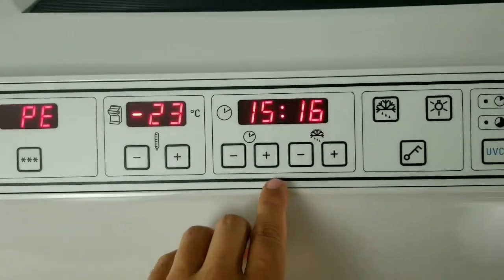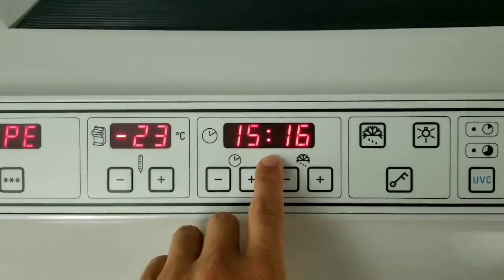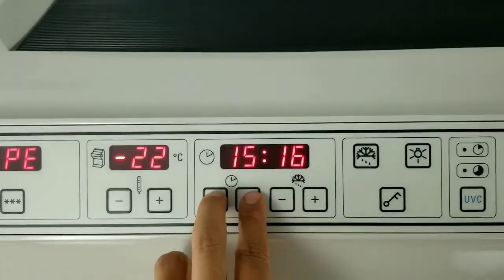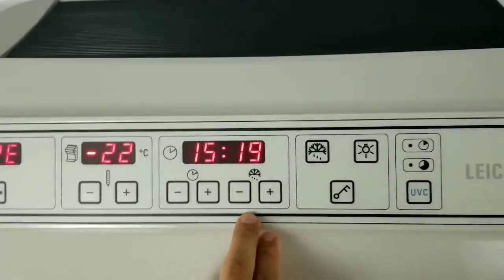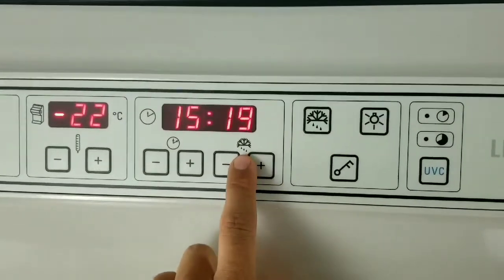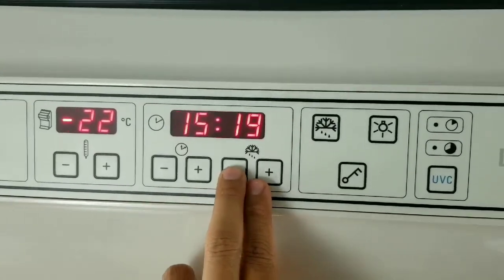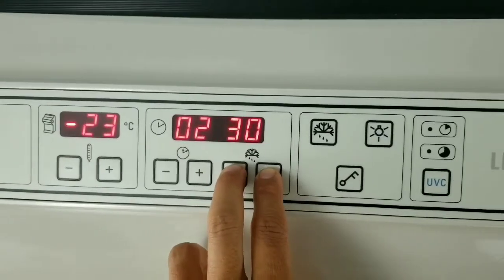The first thing is setting the time. This is your actual time, so it's 3:16 as it's currently set. In order to change that, you can press the negative or the plus and adjust it accordingly. This is your automatic defrost time, and you can set that the same way, using the negative and the positive, and it goes in 15 minute increments.